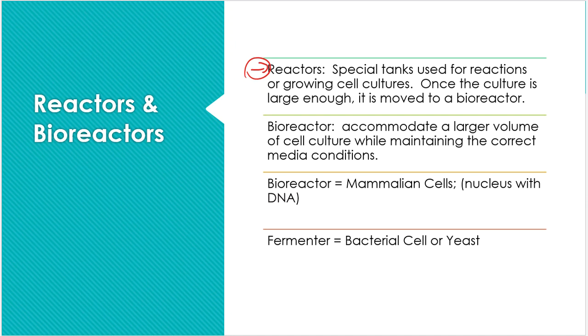So I've got these big reactors, and these reactors are just dedicated to growing. That's all that they are doing. Nothing synthesis is going on in them. I'm not making a product at all in these reactors. These are just big old vats that we are keeping stuff alive in, and that is it.